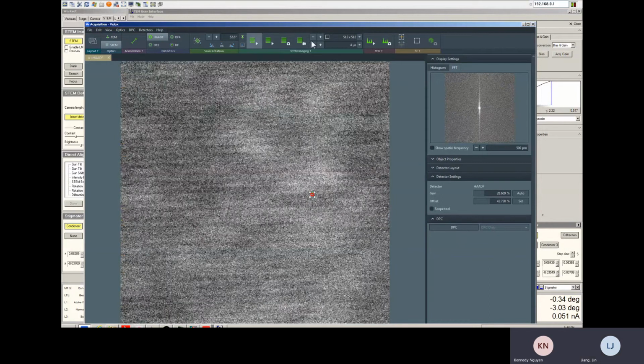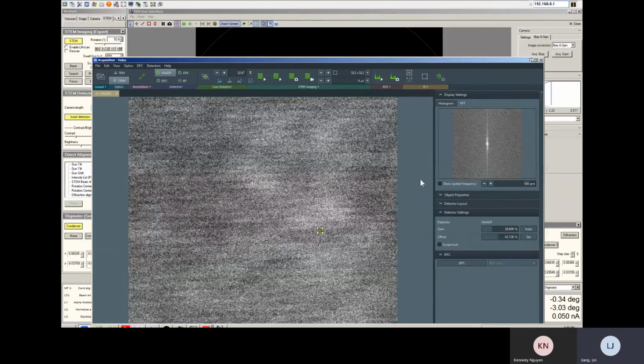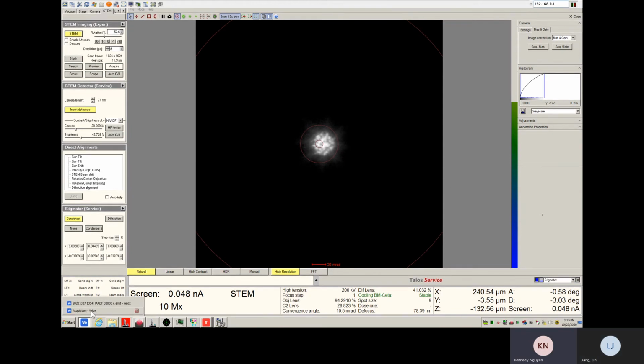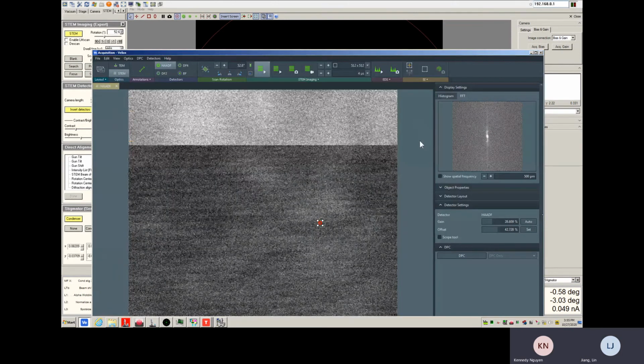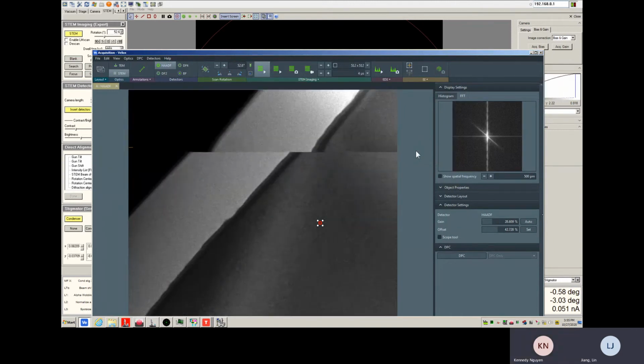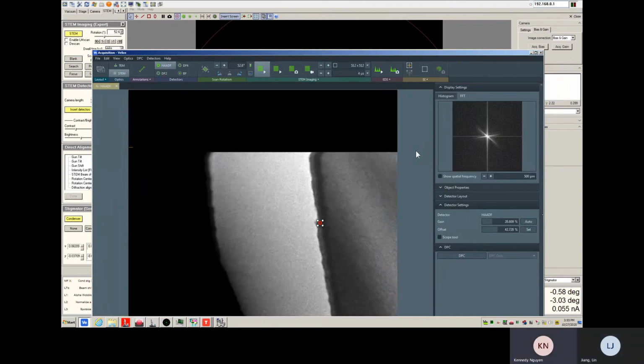I think probably we need to go out of direction to take a look at how the probe looks. Oh, it's a little bit off here. So, go out of direction. It's going to take some time, definitely.